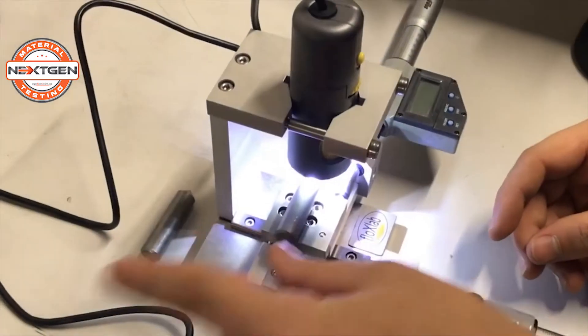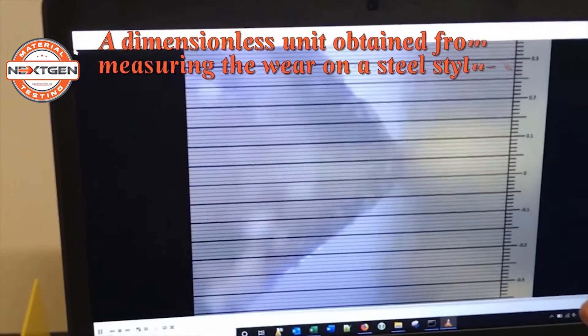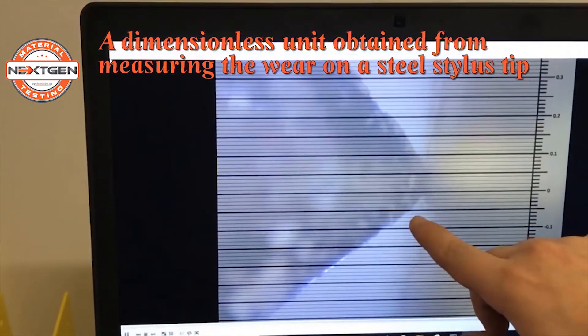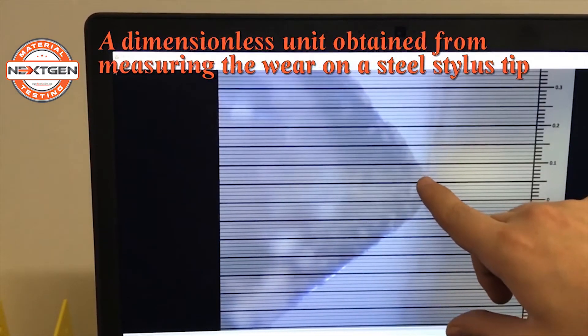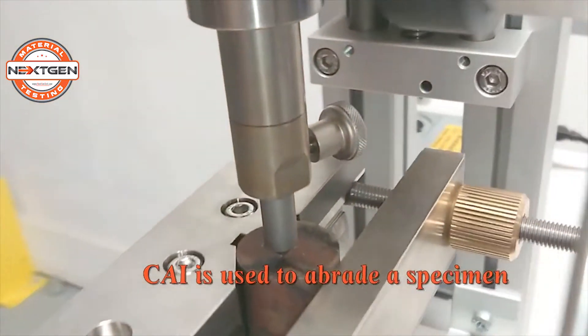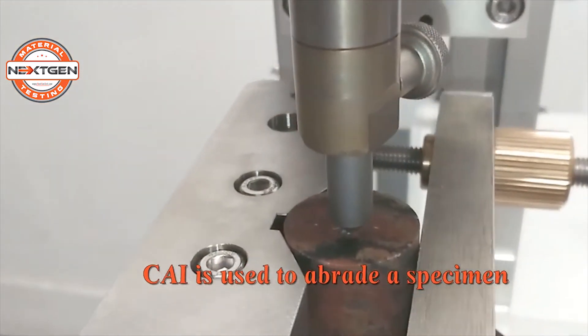The Searcher Abrasivity Index is a dimensionless unit obtained from measuring the wear on a steel stylus tip after it has been used to abrade a specimen with a 70 N normal force.